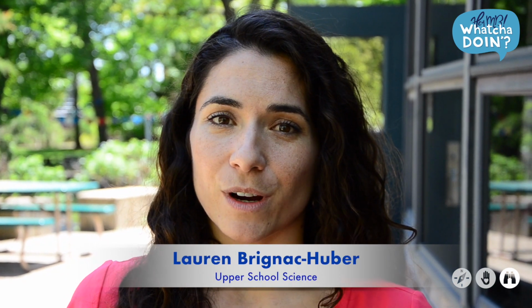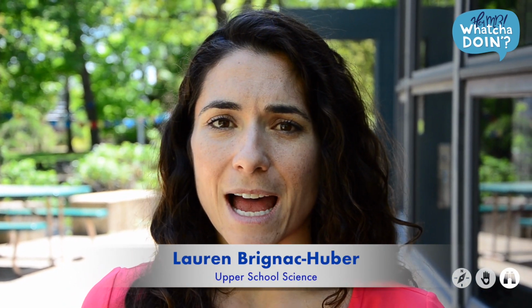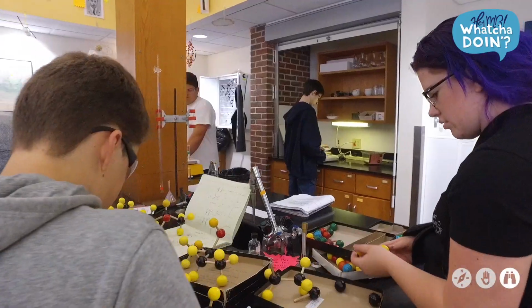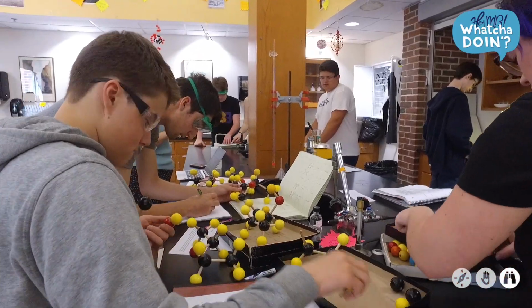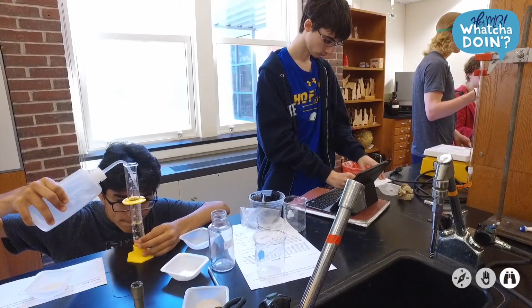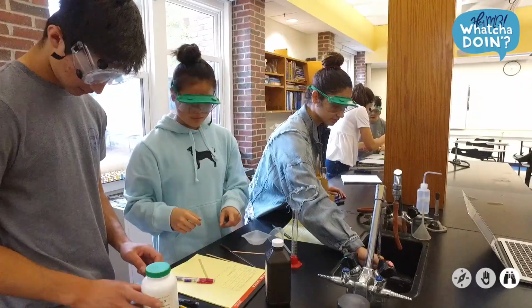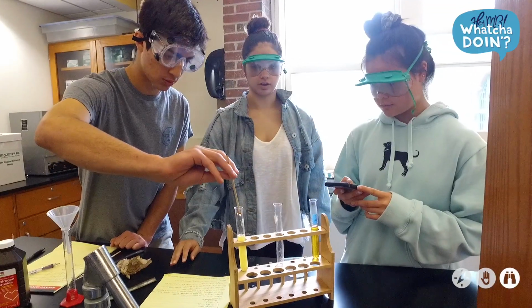A huge part of our chemistry curriculum is having students in the lab all year long to supplement the information that we've been learning during lecture. And at the end of the year, we have this culminating lab practical experience where students are given a prompt and they have to come up with their own procedure and extra supplies that they may need for their lab procedure in order to answer the prompt or answer the question.